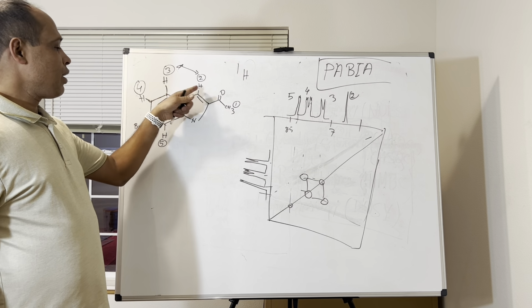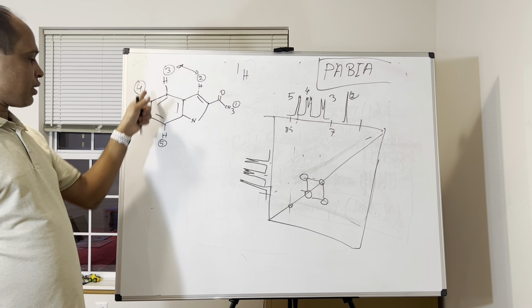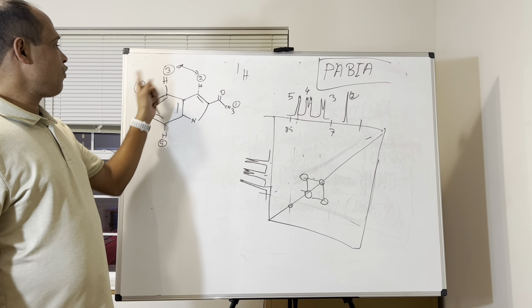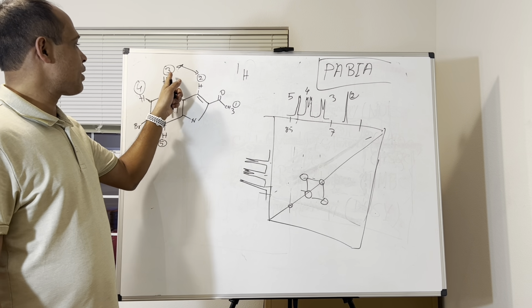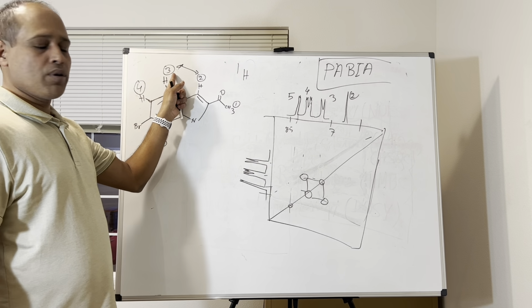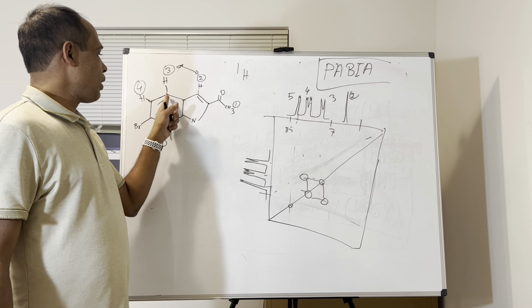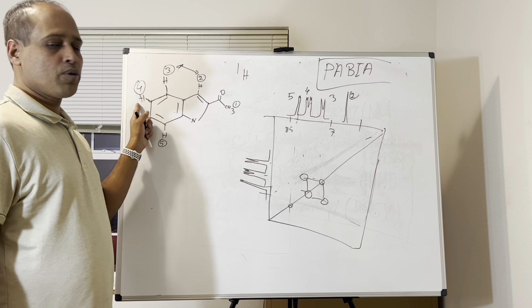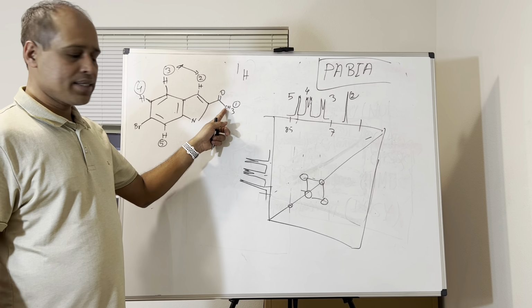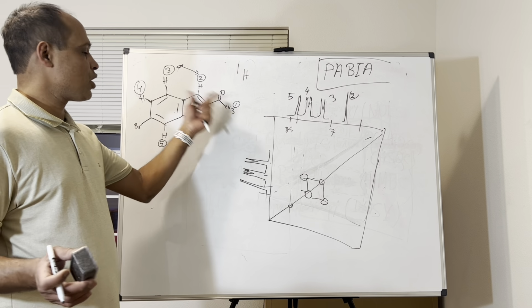Okay, so that's how COSY will determine their neighbors to each other. So ultimately you can identify the singlet, which is number 5, and the 3, 4 positions. With the NOESY you can say 2 is a vinylic proton, and that will have a cross peak with the 3. So you can say, okay, this is here, and ultimately the 4 position will go there. And if you know that, definitely it will be a singlet, there will not be any correlation with anyone because there is no other peak.